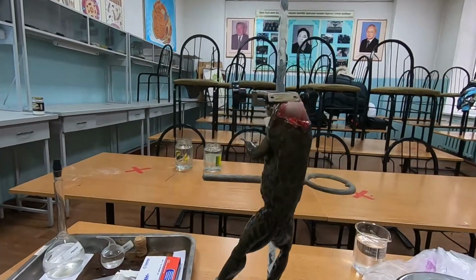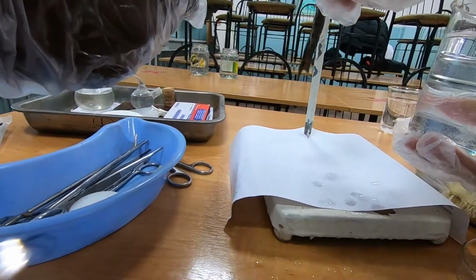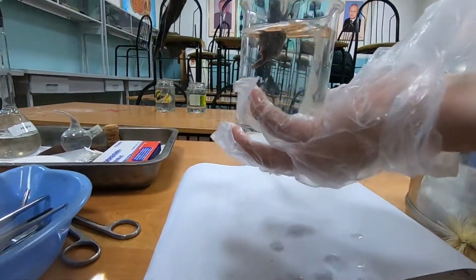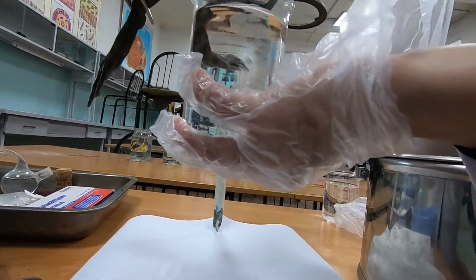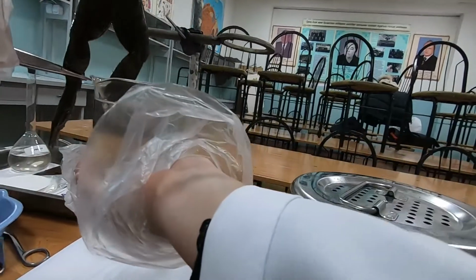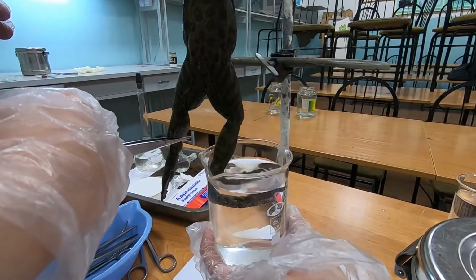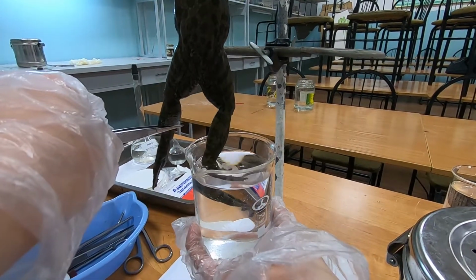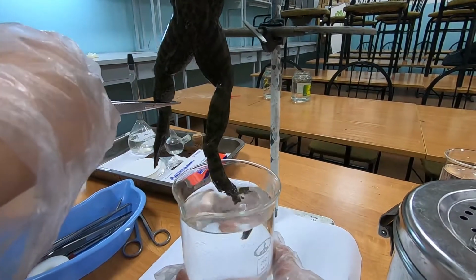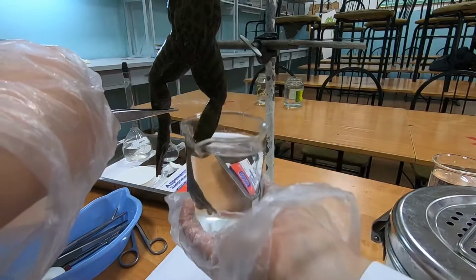So, we use water to wash it, to dilute the effect of the 0.5% sulfuric acid. That's it. Do it like this, up and down.